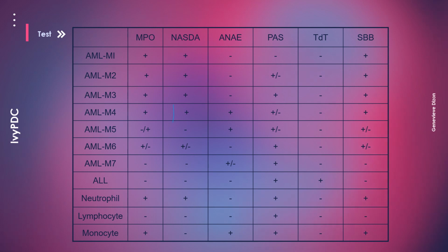Let's also mention that the combined esterase stain or the dual esterase test is used for the identification of M4, and this will give a positive reaction for both the specific and the non-specific esterases. Next, we have the periodic acid Schiff, which is mainly used for the identification of M6 or the Di Guglielmo's syndrome. But since most of the cells would be positive for glycogen and therefore positive for PAS, except for the myeloblasts present in M1. Other notable mention for PAS would be the pattern present in the different kinds of cells.